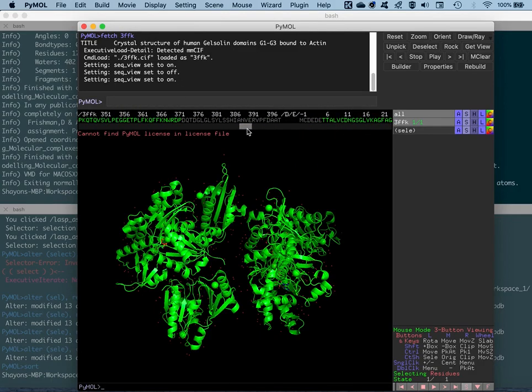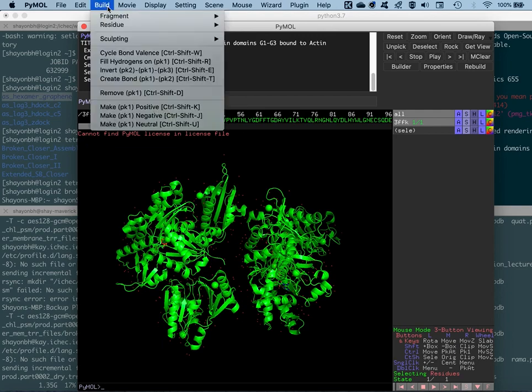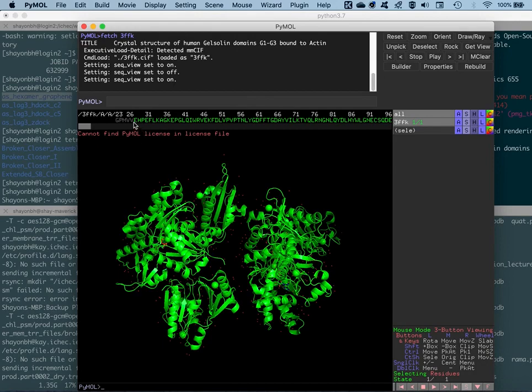This information is very useful because in the next tutorial, advanced characterization by X-ray methods, we'll be reconstructing these missing residues via an ab initio scheme, by manually curating the missing regions using the build and sculpt tools available in PyMOL, and also by homology modeling, where we'll be using available PDB structures which have a high sequence identity as templates to model these missing regions. So it's going to be a lot of fun. Okay, let's cut to the chase, otherwise we keep digressing to these other amazing capabilities of PyMOL.